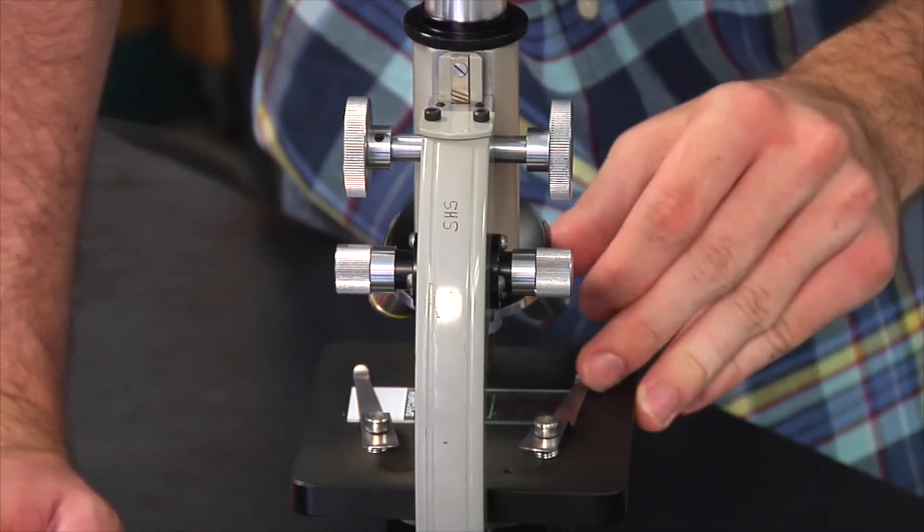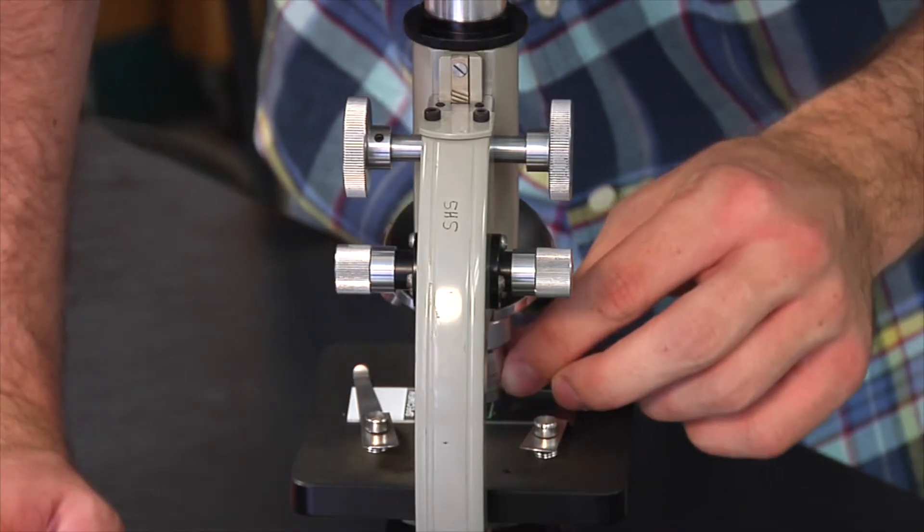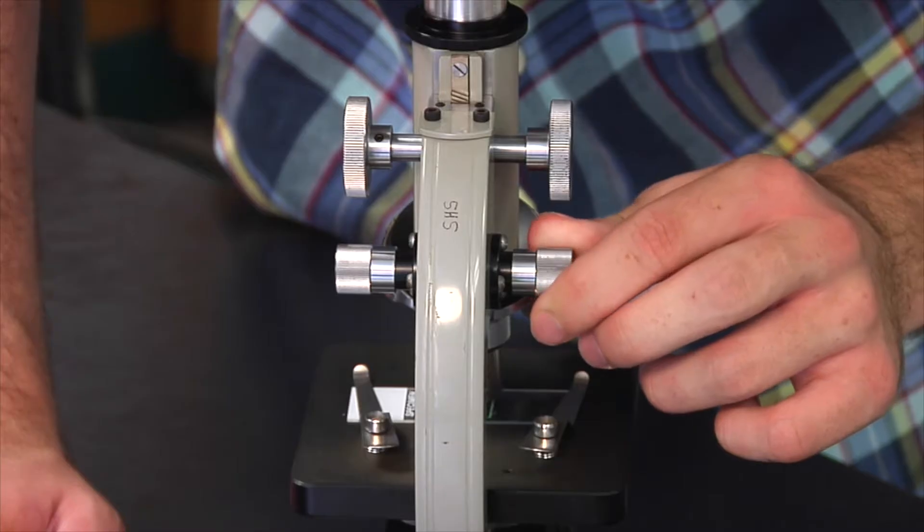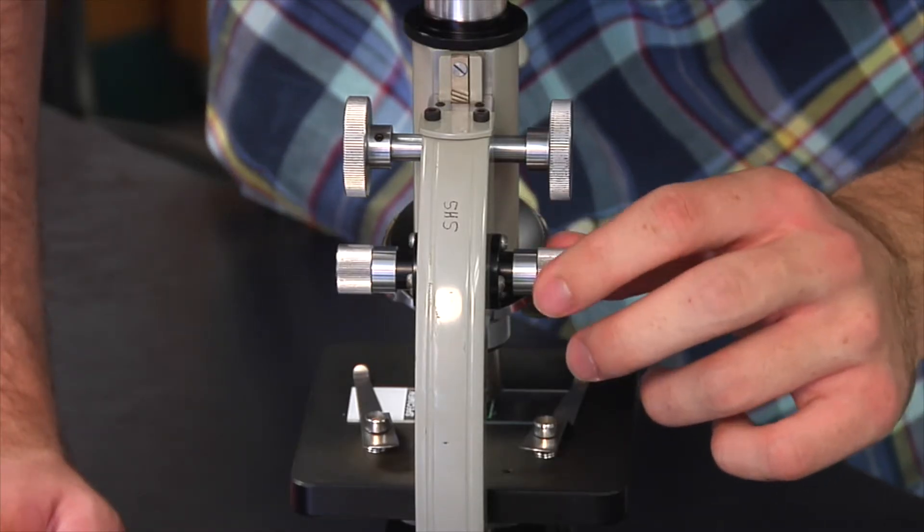Once the specimen is in focus, rotate the objective lenses to view the specimen at higher magnifications. To get the best view, use the fine adjustment knob each time the magnification is changed.